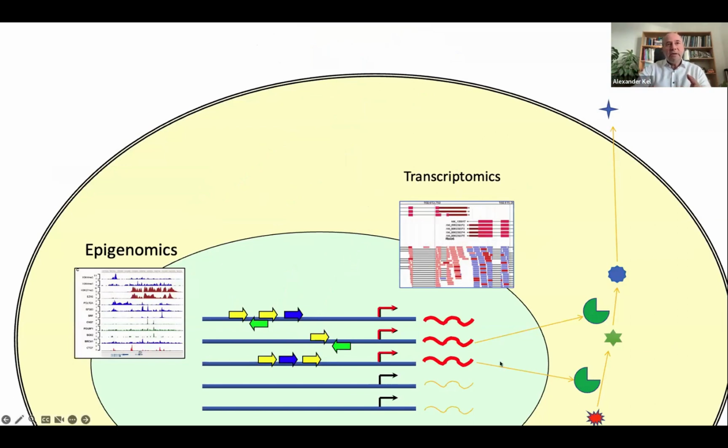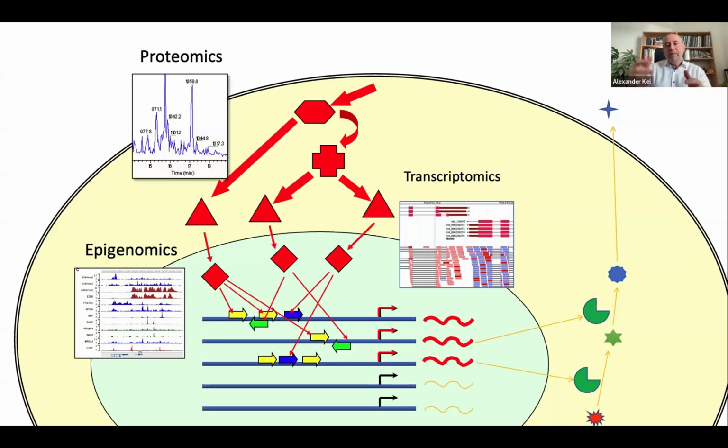Here in the picture, you see more like ChIP-seq data, when you know which transcription factor, or for instance which modified version of nucleosome, is binding to which places. Pretty similar is ATAC-seq data, when you don't know which factor is actually involved. You have to guess, and that's how you will use TRANSFAC here, but you have knowledge about which regions are open and which regions are closed.